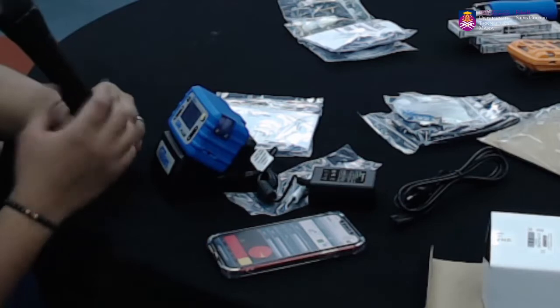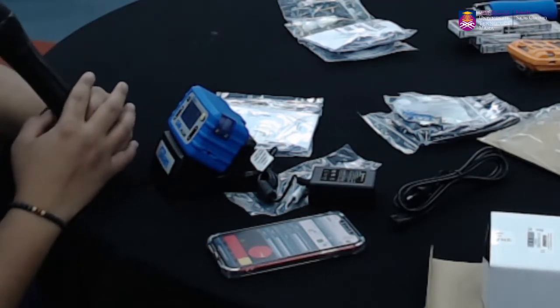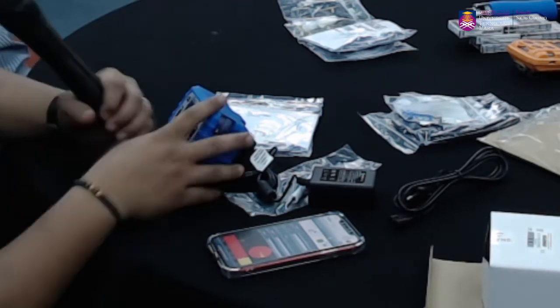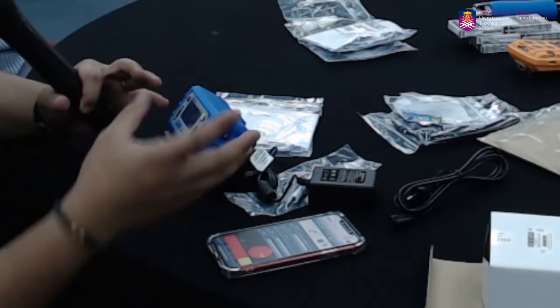So charging tu boleh on, boleh sample. Yes, boleh sample untuk collect sample. Tapi usually docking ni kita biar dekat kat office ataupun bila kita nak balik, tempat kita nak simpan storage kita tu, usually that is the place kita charge lah.